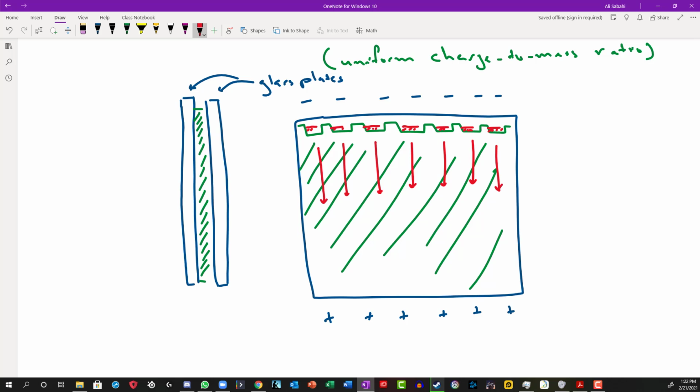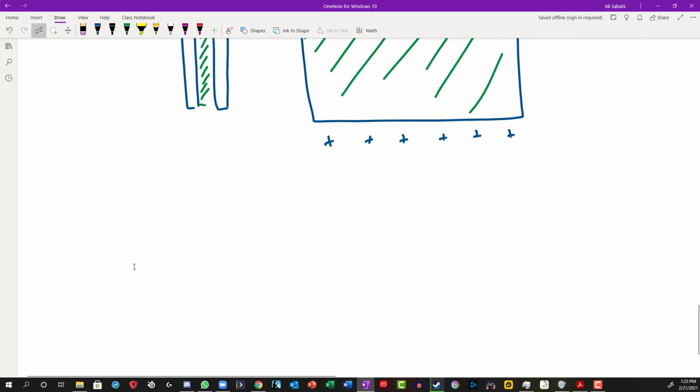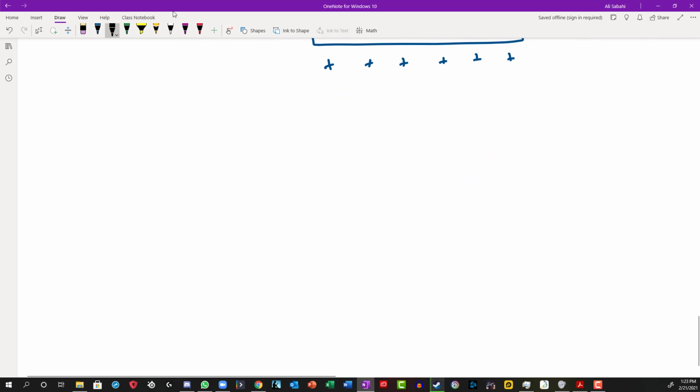Now, how will they be separated based on their size? If I have a small polypeptide chain, N-terminus, C-terminus, compared to a bigger polypeptide chain, and I have this negative charge applied to it because of the SDS being bound to it, so it's negatively charged here, more negative charge here.